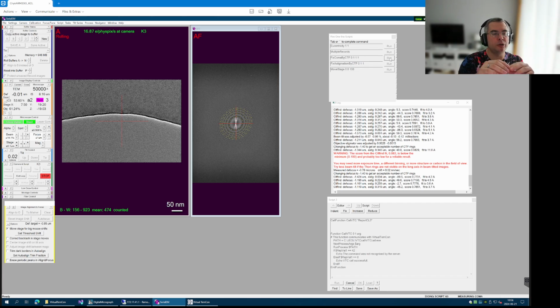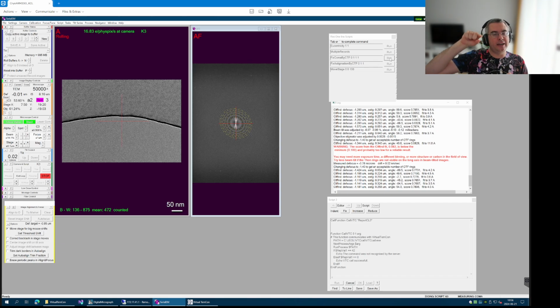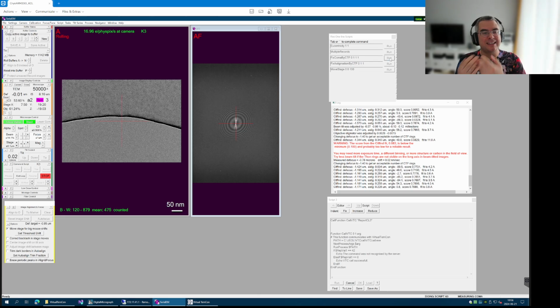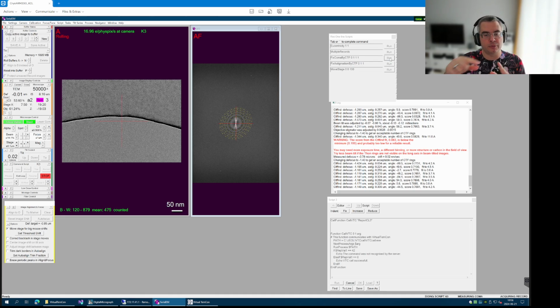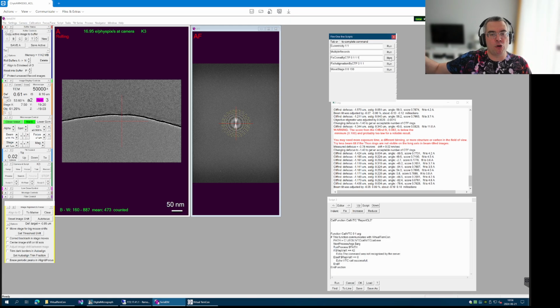However, if you want to use a larger grid, 5 by 5, 7 by 7, or even more, then you really need to measure the two most distant points. This way, we don't extrapolate correction factors from these small distance measurements, but we measure a long distance and then we interpolate within this distance, and it just gives better results.